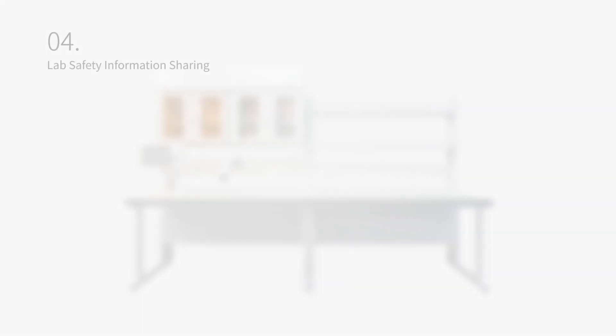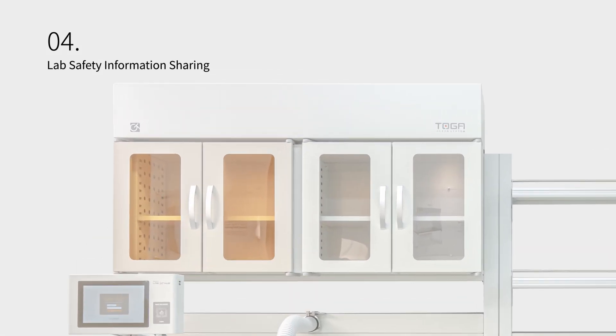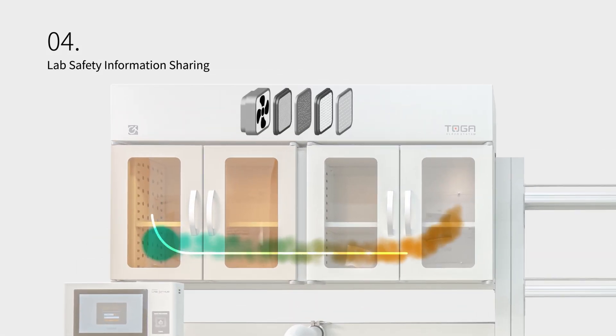The platform can also be used for taking lab notes and reports. Protect users from danger by removing noxious gases with patented TOGA filter system built into tabletop reagent storage.